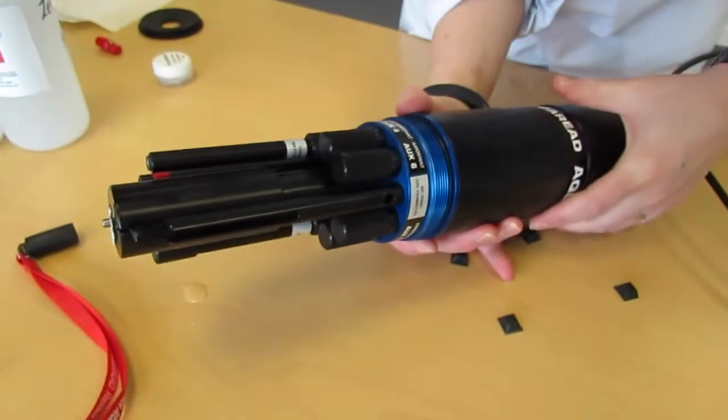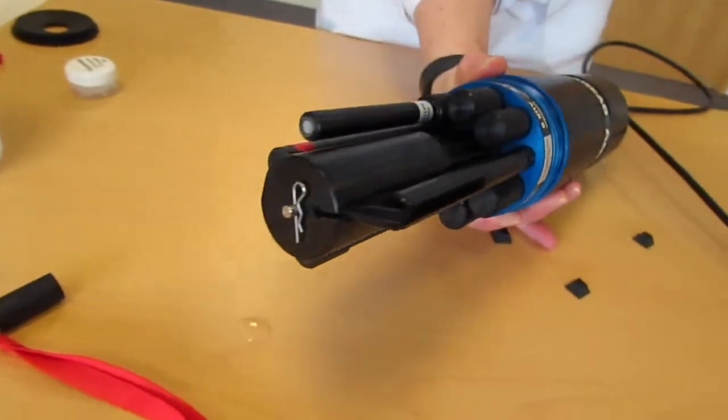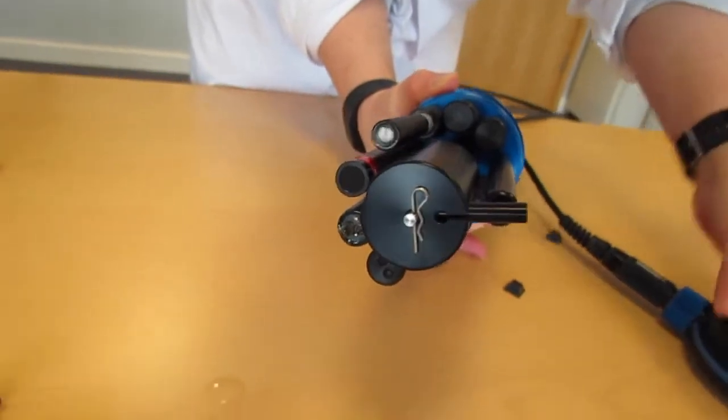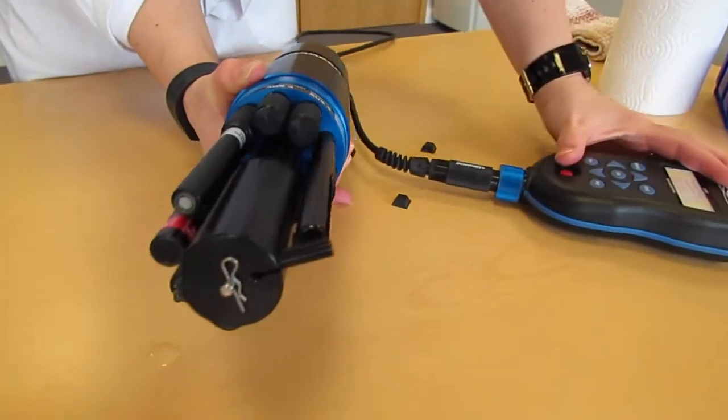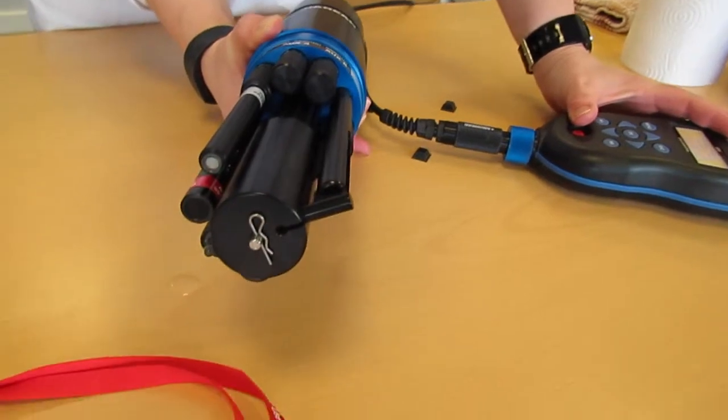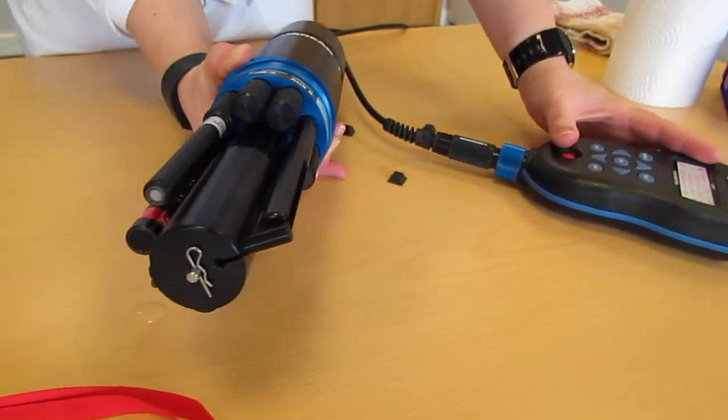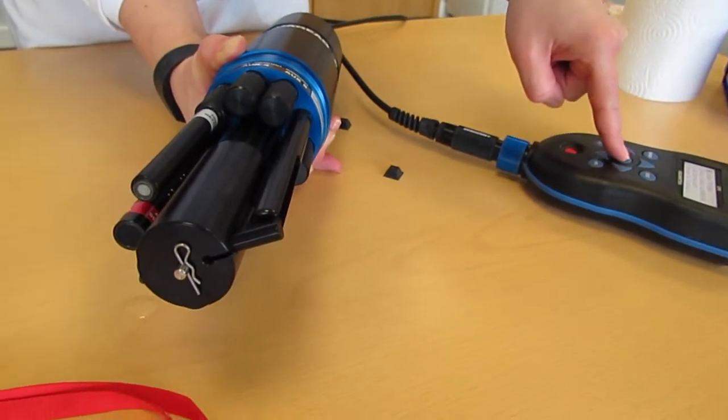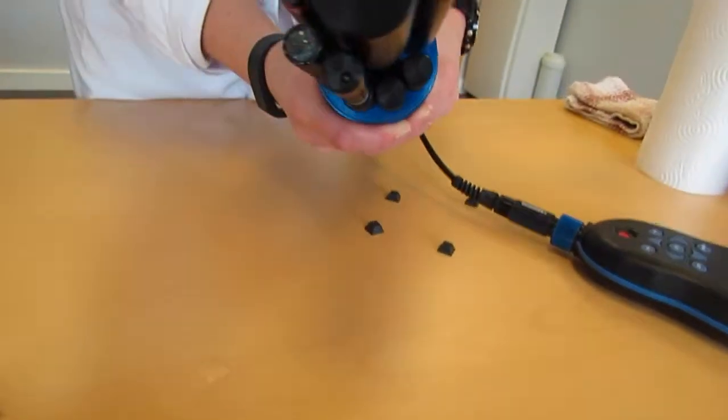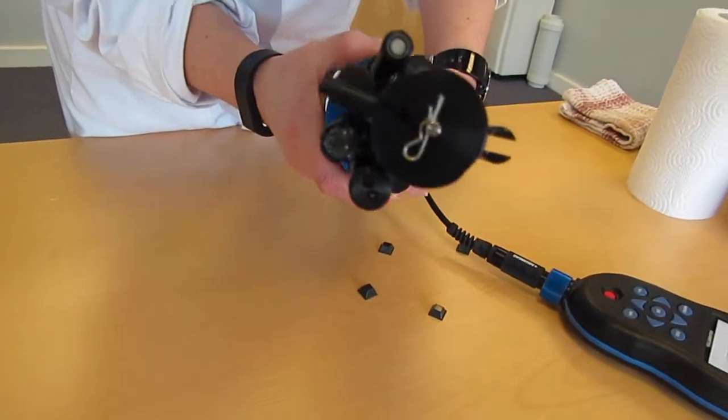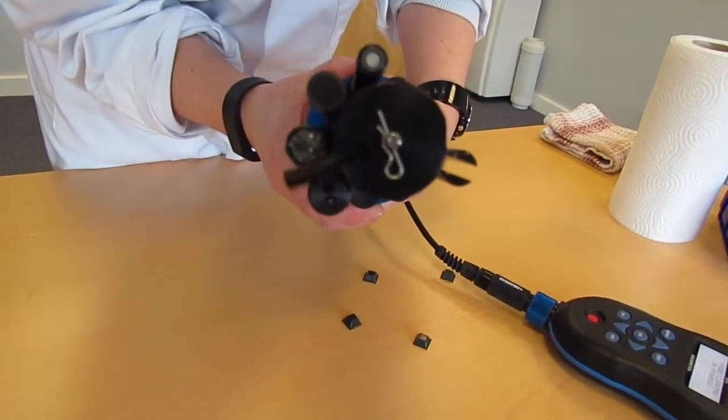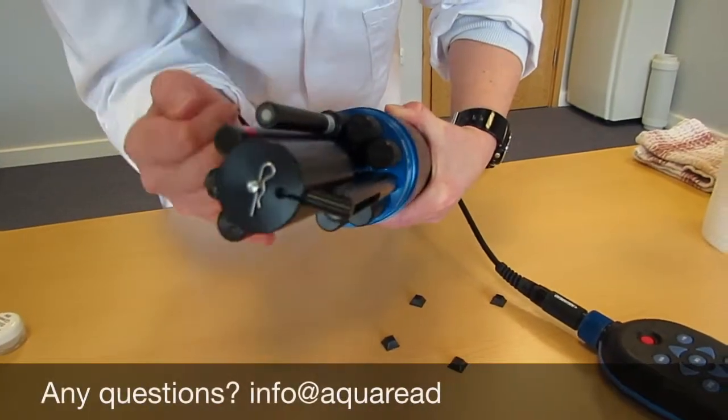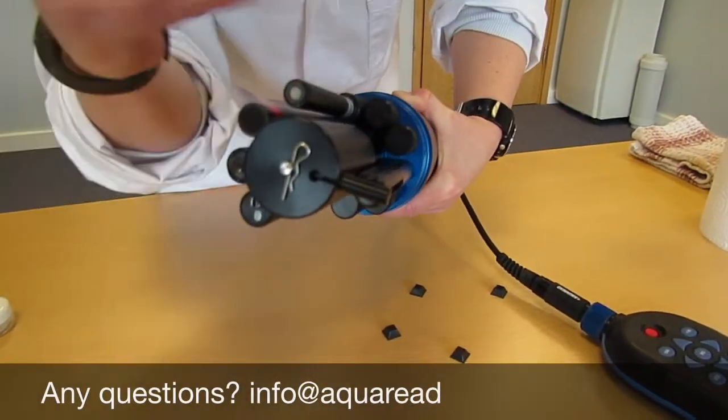We can now check whether the wiper arm is cleaning properly by turning on the meter. If we go to menu and clean probe on the meter, then we will see that it is cleaning all of the terminals. And as we have assigned aux 1 and aux 2, it is also cleaning these sockets, but not the ones that we haven't assigned.